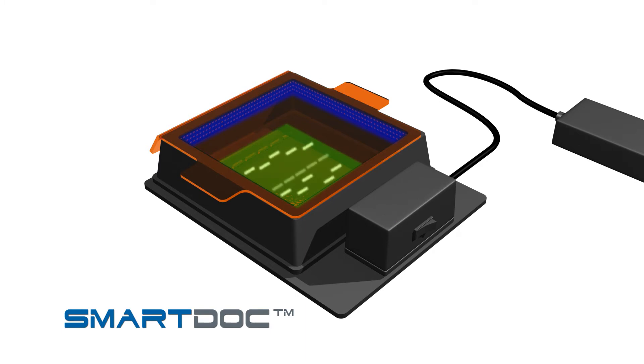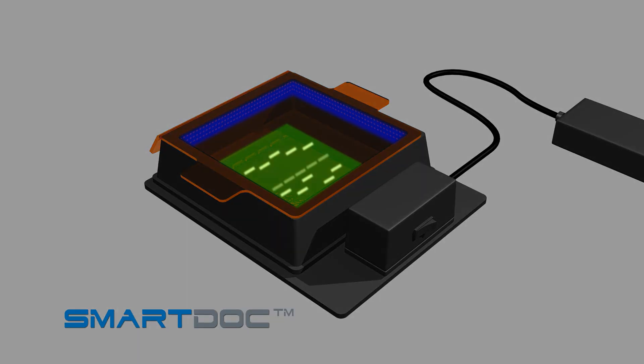The SmartDoc's powerful LED lights provide a peak excitation wavelength of 460 nanometers. For best viewing results, dim or turn off any overhead lights and use the SmartDoc away from bright window light. With the SmartDoc lights on and the orange filter in place, your DNA bands are now visible in your gel.